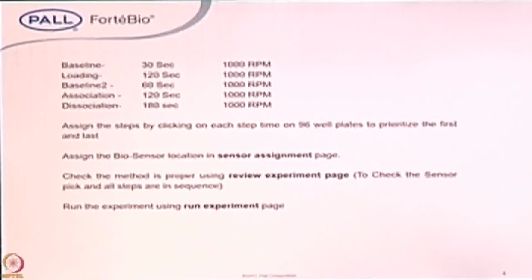This feature is not available in the case of SPR. Once you fix this time, you can't change it. But in the case of BLI technology, it's possible to play around with the timings.